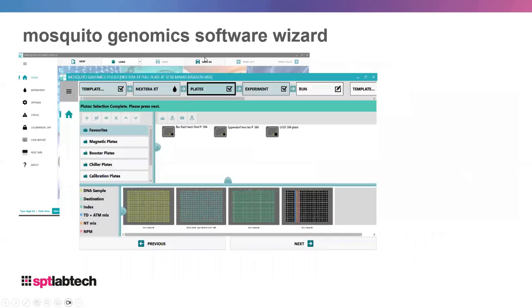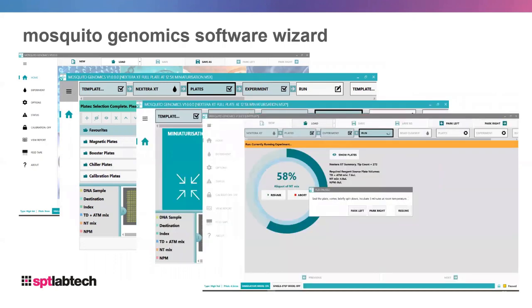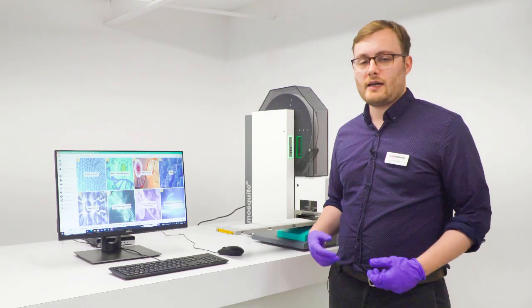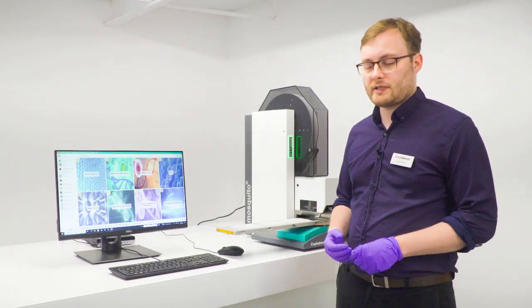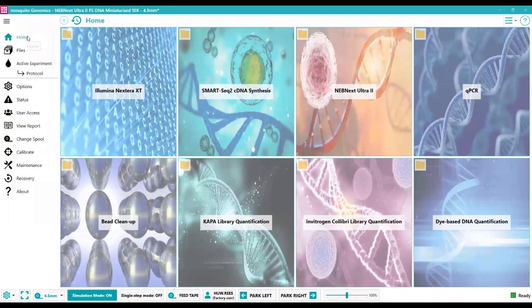When you open the software wizards you get brought to a page where you can modify and customize the experiment however you wish. It's easy to set up an NGS library prep on the Mosquito using our wizards. Opening the software introduces a page with default wizards for NGS library prep protocols, and you can customize these experiments and have one displayed for whatever workflow your lab primarily uses.